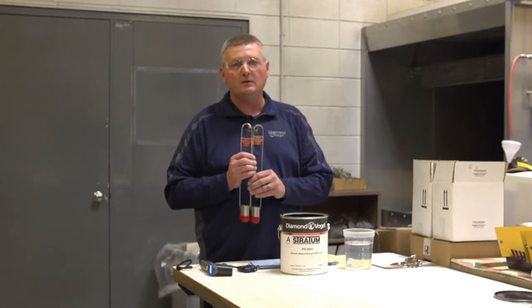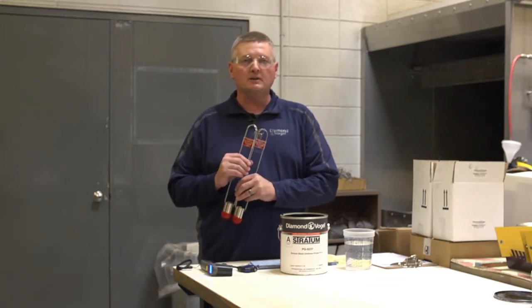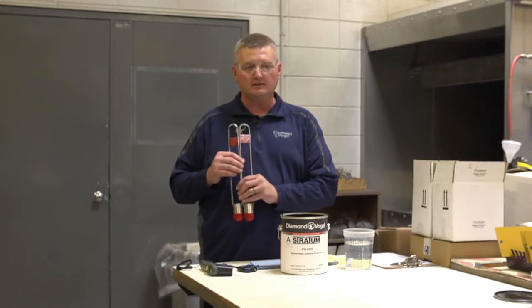The Zahn cups range from number one to number five. The times on the Zahn cups are good from 16 seconds to 60 seconds.